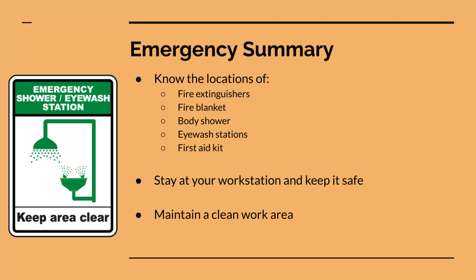Other than that, let's say those aren't working, you've got all kinds of sinks to use too. The first aid kit is found in the back of the room, in a blue box. The body shower is in the front, the yellow shower. The fire blanket is also in the back, in a big red case with a little flap that you just pop and the fire blanket comes out. And I only have 1 fire extinguisher in my room, right next to my desk. It's an ABC fire extinguisher that I get to use. You don't.